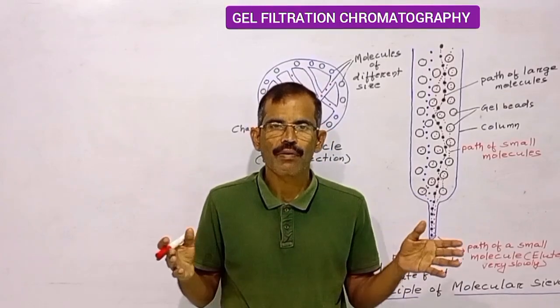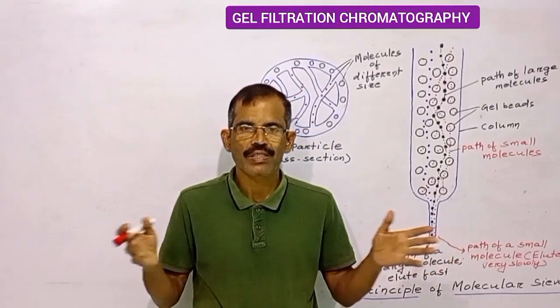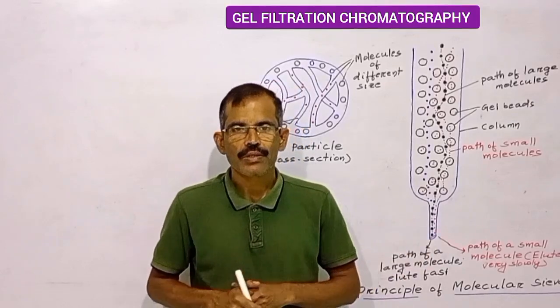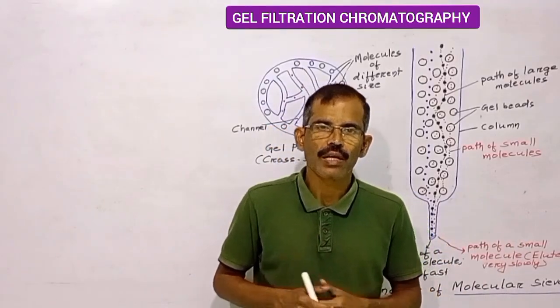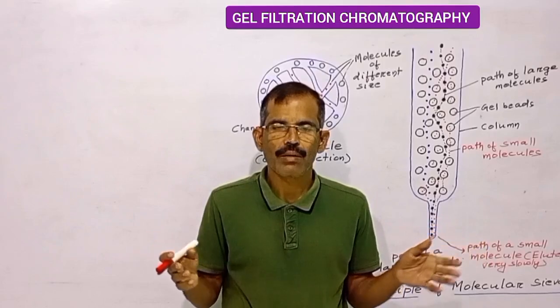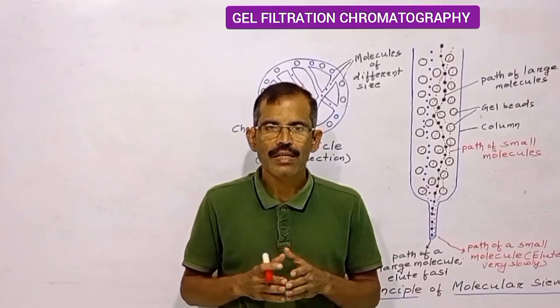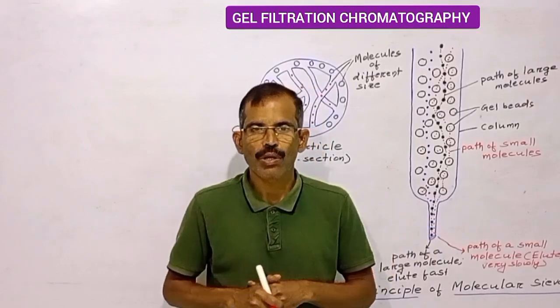Gel filtration chromatography is a powerful technique that separates molecules on the basis of their size and shape. It exploits the molecular sieving properties of a variety of porous materials. This technique has widespread applications and many advantages, such as gentleness of the technique, thereby permitting the separation of labile molecular species, excellent reproducibility, almost 100% solute recovery, comparatively short time and relatively inexpensive equipment required for its operation.